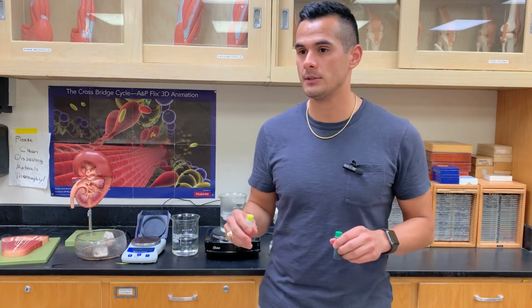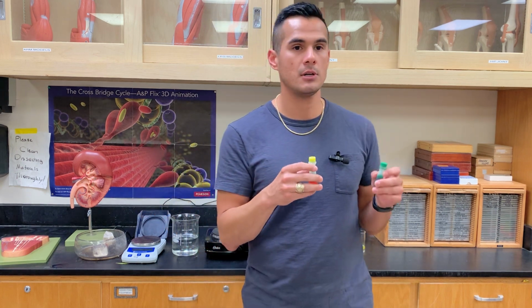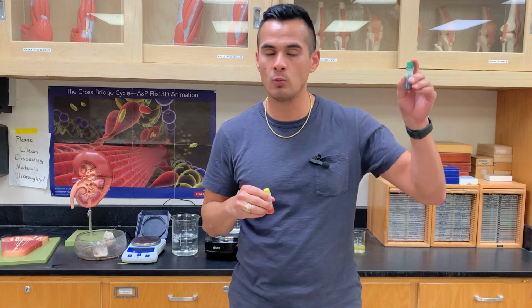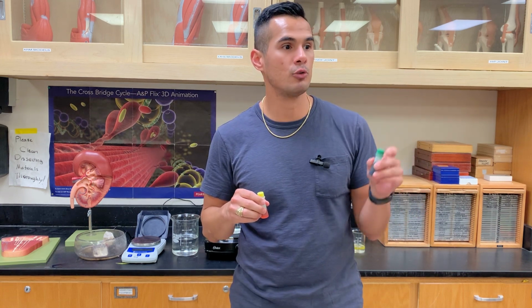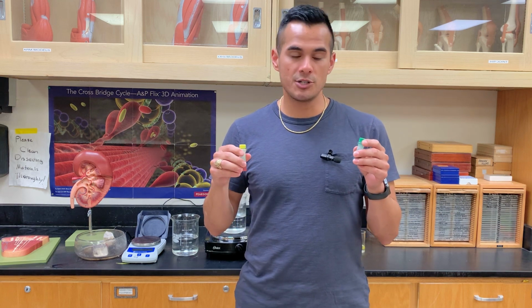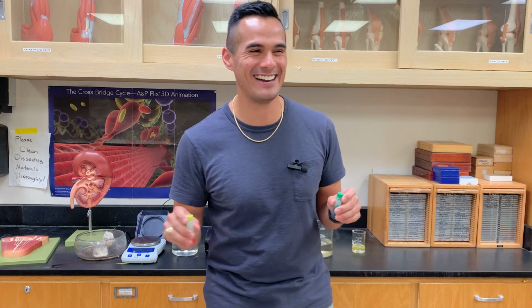So someone grab that other one. Yes. Okay, so let me explain what we're going to do. We're going to add a drop of each. One will be in the hot beaker and one will be in the cold beaker. I want you to do this at the same time, but not yet. I know you're excited, yeah.